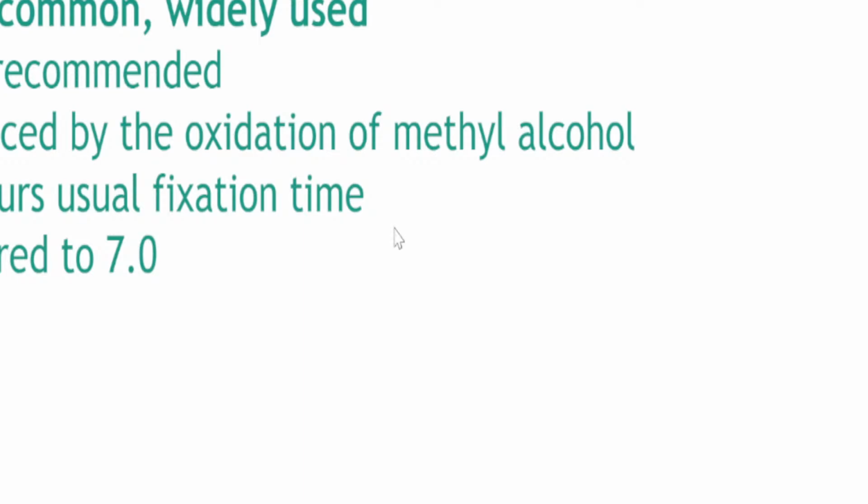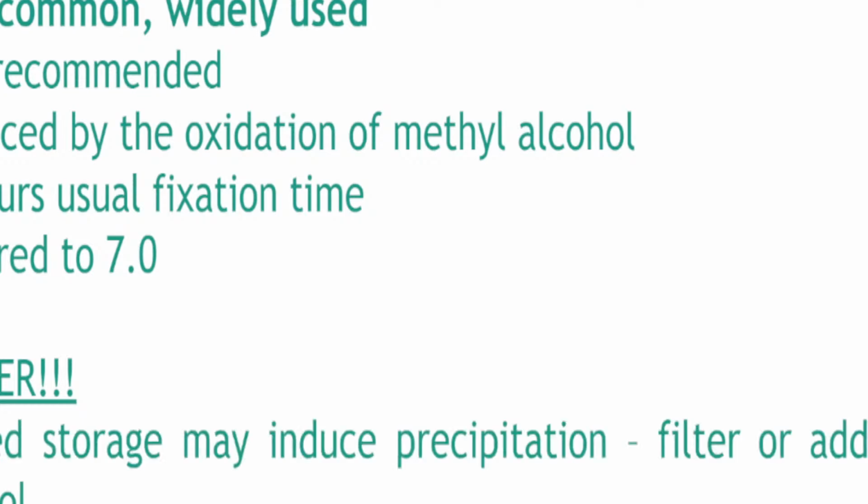Very straightforward class, di ba? Memory work lang siya. Okay? Next, remember, prolonged storage may induce precipitation. You either filter it or you add 10% methanol.